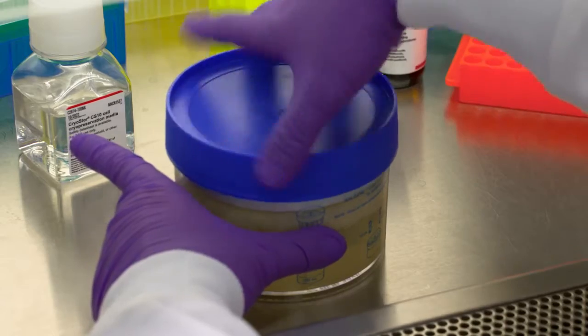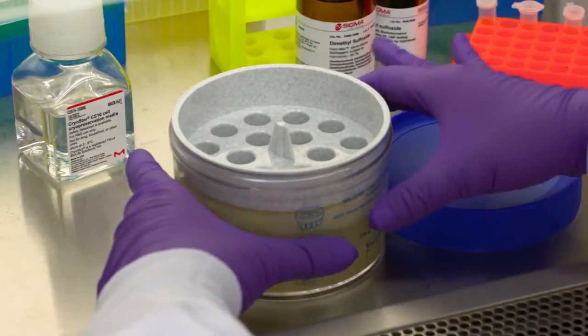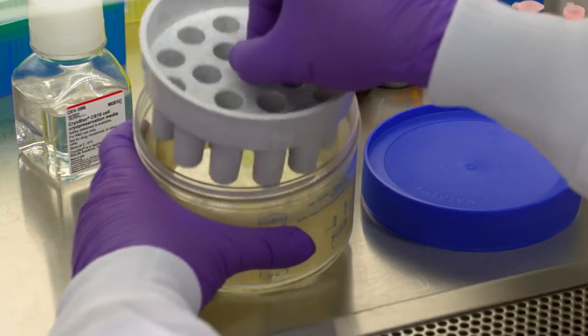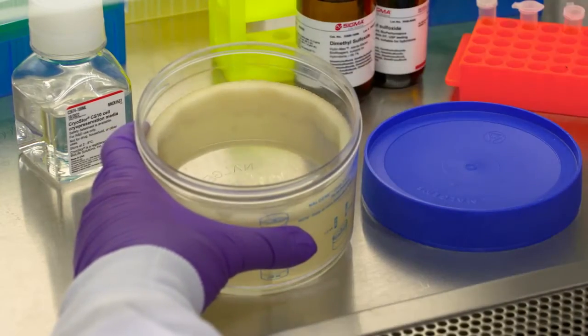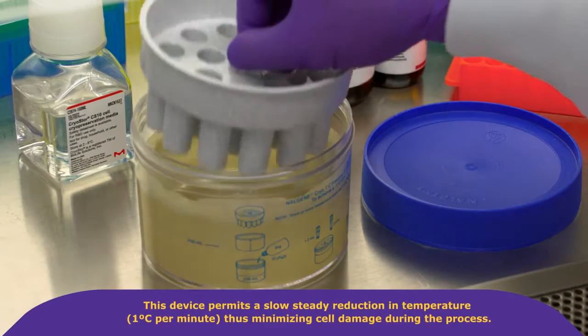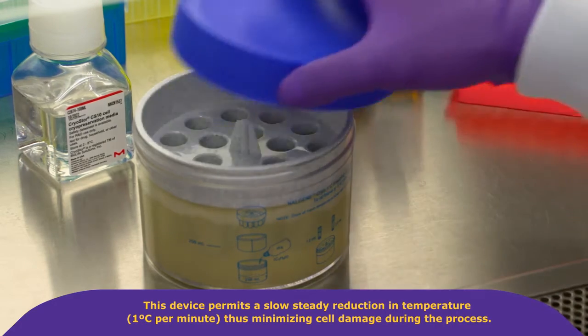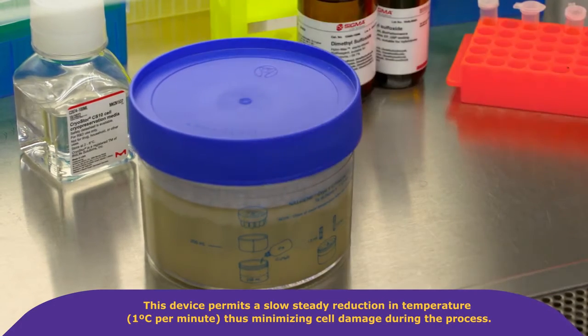Also prepare an appropriate freezing container with the right volume of isopropanol. This device is used to transition cells to freezing. It permits a slow, steady reduction in temperature — one degree Celsius per minute — thus minimizing cell damage during the process.